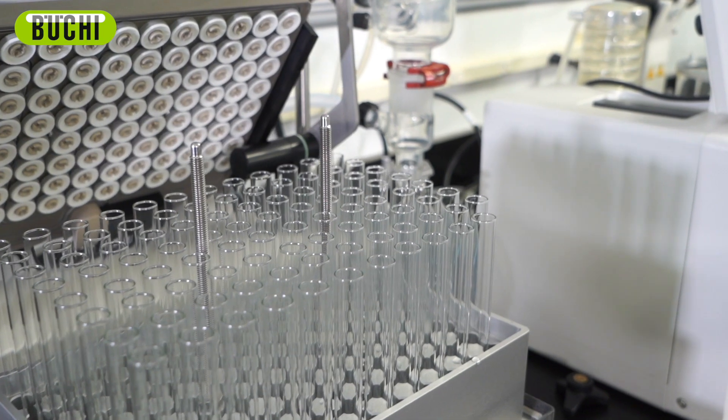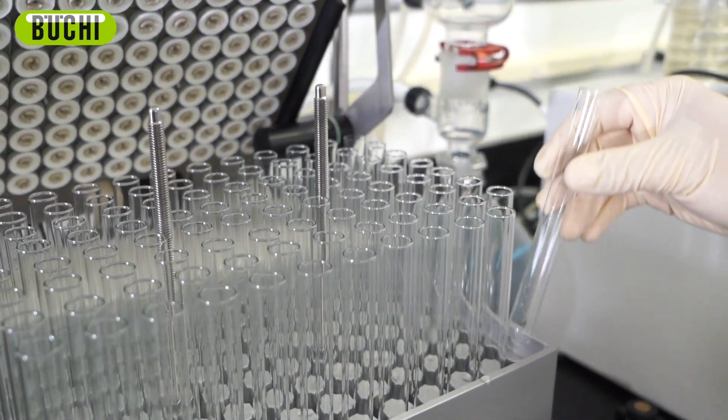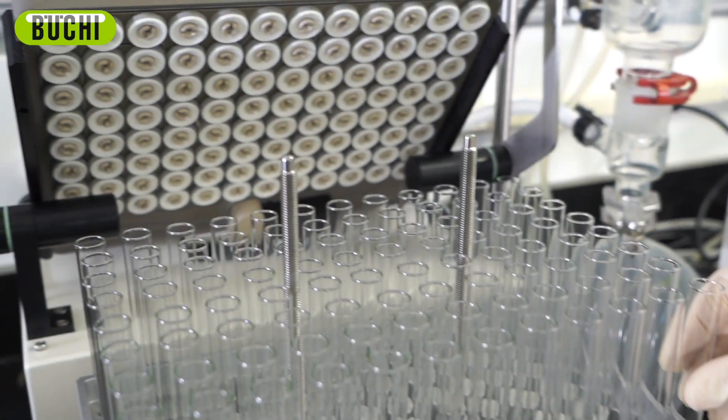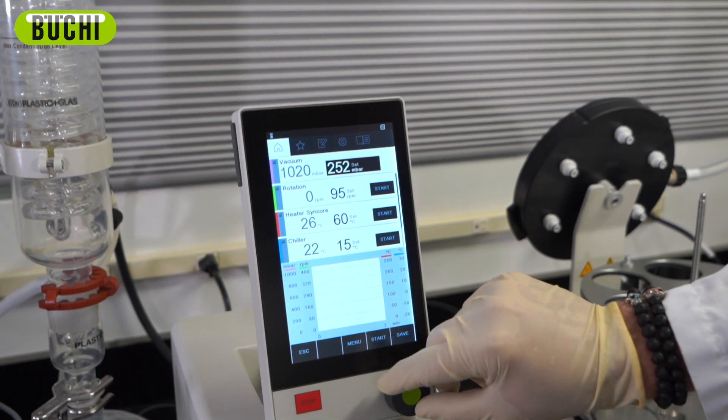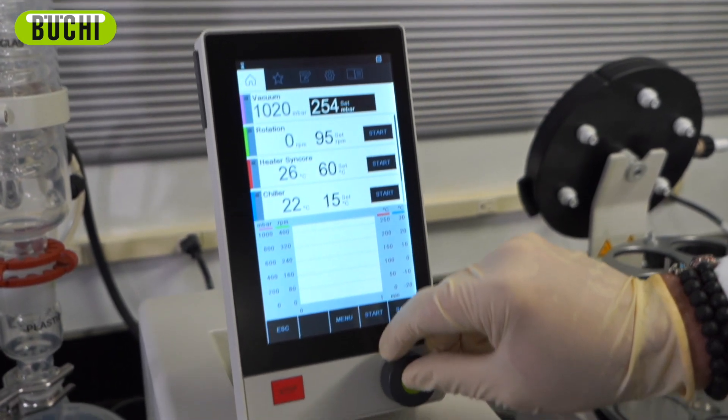In contrast, the Syncor Plus Polyvap has no predefined volume and is intended for simultaneous evaporation of multiple samples. Though the purpose of the Polyvap is full dryness or evaporation, the intuitive vacuum controls also allow you to concentrate your analytes.